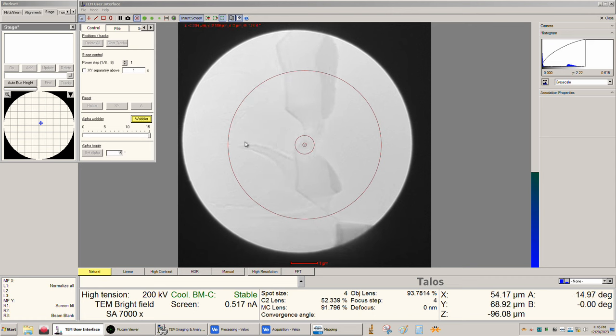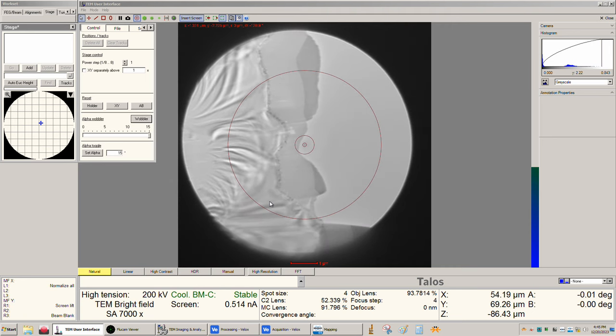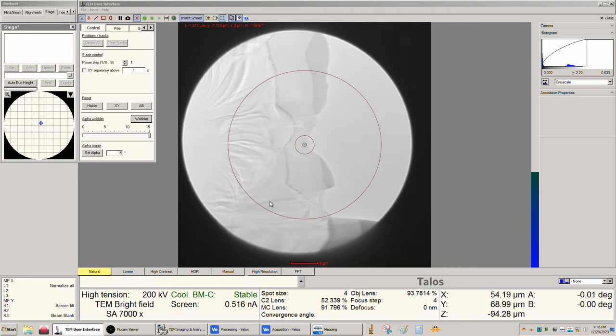So you can see there's a little bit of side-to-side shift, but it's very small. This isn't quite accurate, the scale bar, but you're talking about less than half a micron of shift. So that's really good. That means that what we did was we focused with Z. We didn't actually set mechanical eucentric first. We focused by pushing eucentric focus and then adjusting Z. So now I'm out of focus until I get minimum contrast. So right about in here, okay.